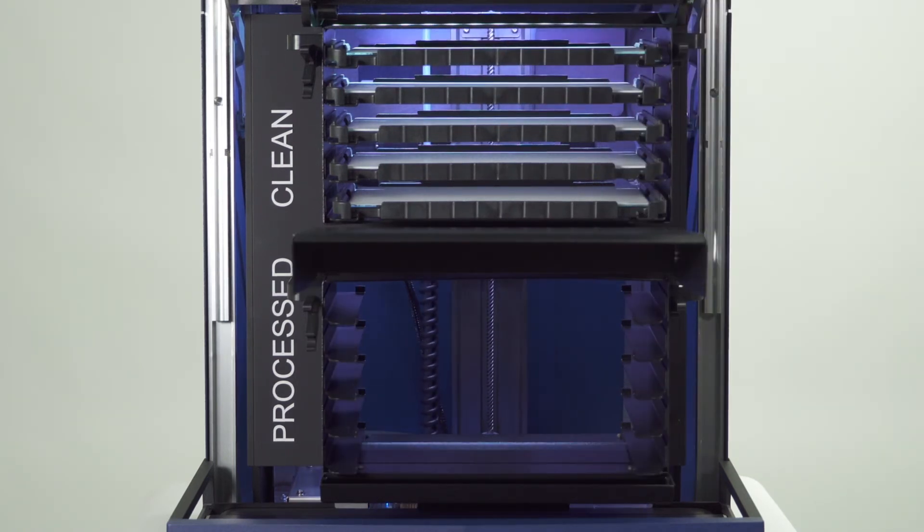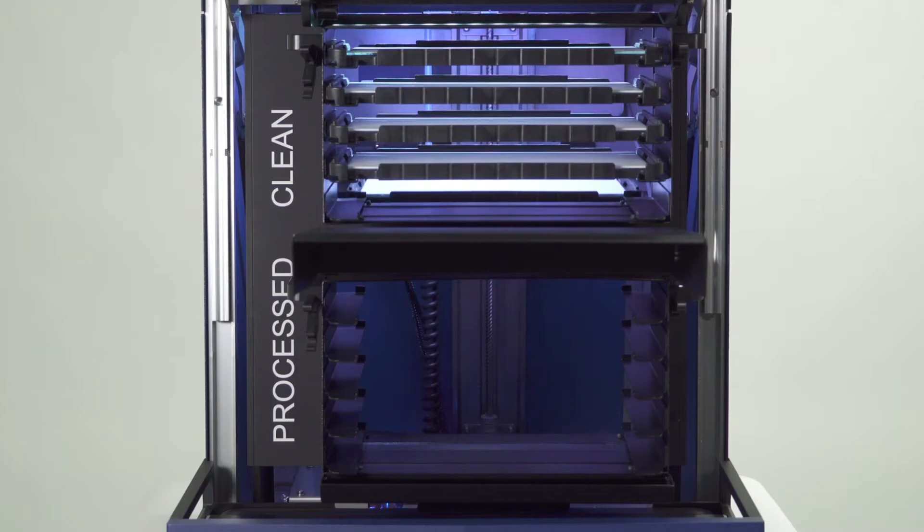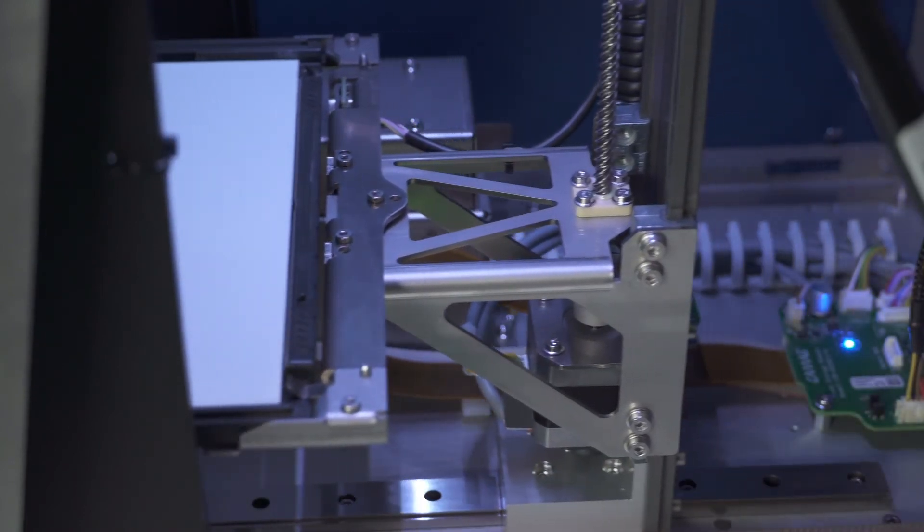The lifting mechanism brings down the HPTLC glass plate from the stacker for clean plates to the built-in conveyor, which transports the plates within the HPTLC Pro system.